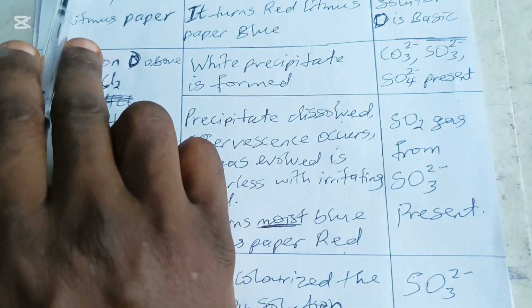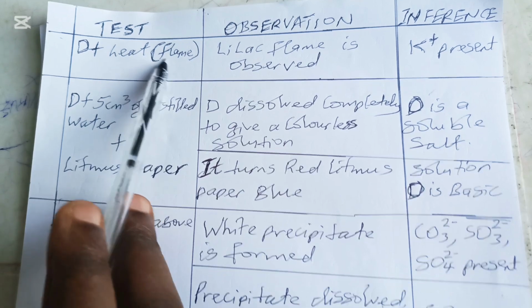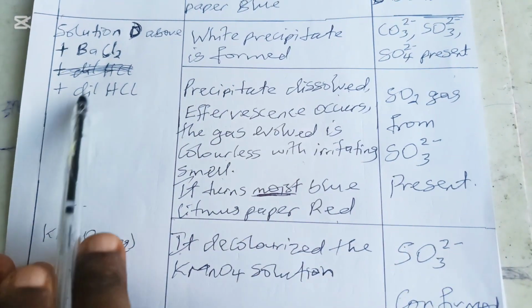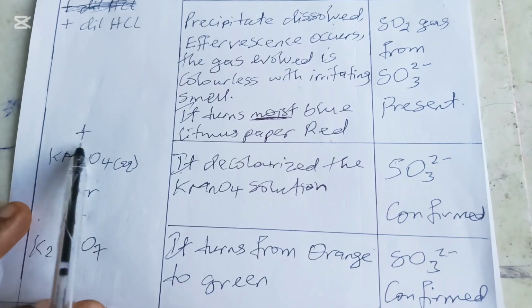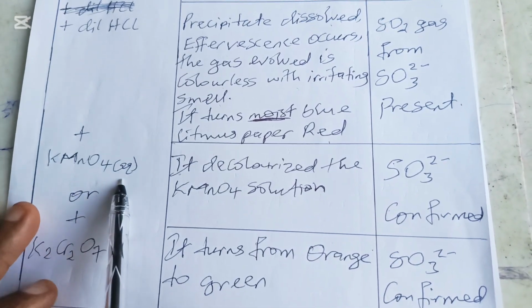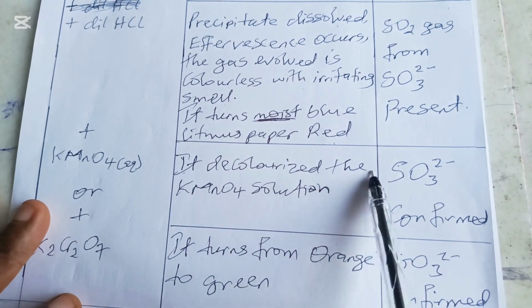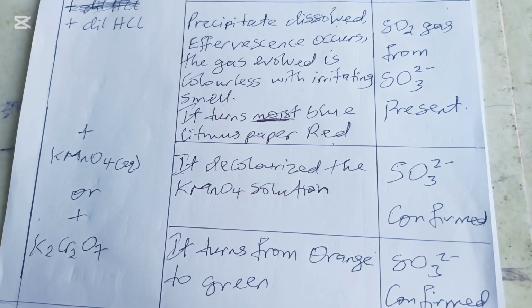This is the only place you can write D, because the salt directly is what you are putting into the flame. But here, the salt has been dissolved. It is a portion of what is dissolved that they will tell you to do further tests on. Now, they might tell you to test with KMnO4 to see what happens. If you test with KMnO4, it decolorizes KMnO4 solution. It turns from purple to colorless.